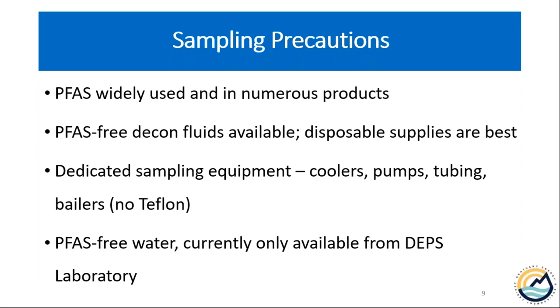As we've already seen, PFAS are widely used and found in numerous products. We do have PFAS-free decon fluids available. However, as much as possible, we try to use disposable supplies, again, to eliminate as much potential for cross-contamination as possible. You should always have dedicated sampling equipment for your PFAS monitoring.